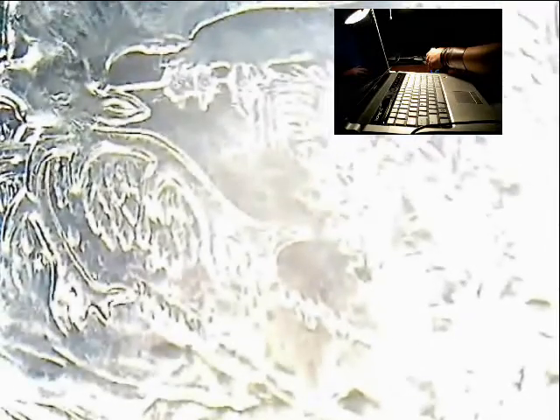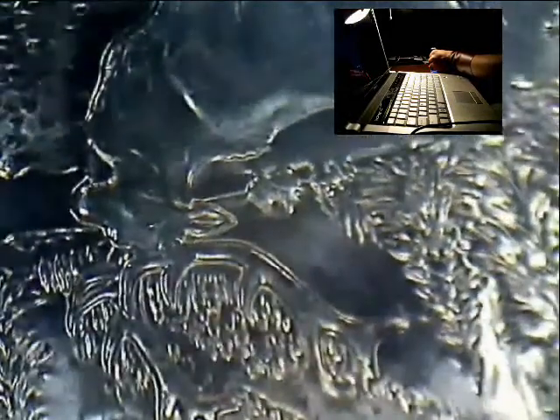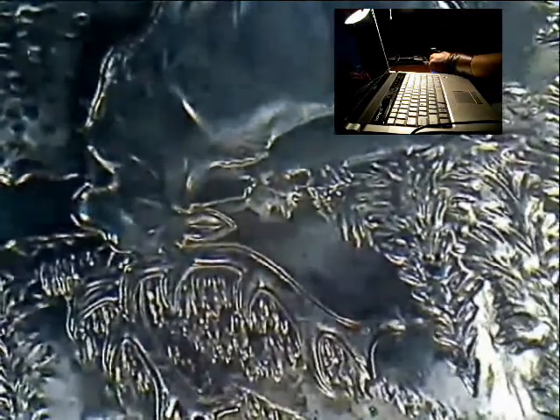Someone had mentioned that they were looking at coins, so I've got myself a coin. This is Olympic Park of some kind, I believe, in Washington. This is one of the state quarter series, but this was after they finished all the states. There's a lot of glare on that. Let me turn down the LED some. You can see I've got it kind of upside down here, but there's a large horned animal. I can rock through focus, try and get good focus. We're going to zoom in to high. And you can see pretty good detail on that. I can pick this up and keep it fairly close and move it around. Usually a little bit may come out of focus, so I keep my hand ready to try and bring it back into focus. But it's usually best to try and get it centered on what you're looking at and then just set it down and adjust focus.